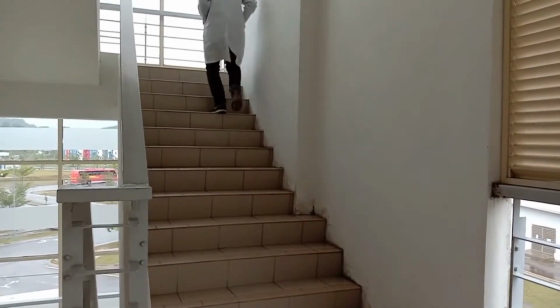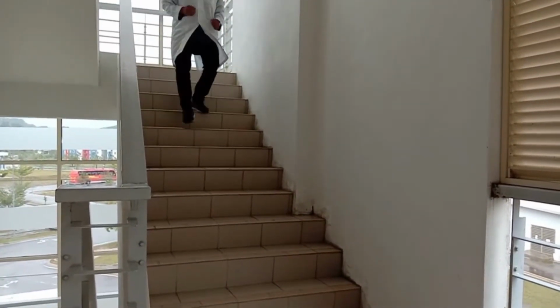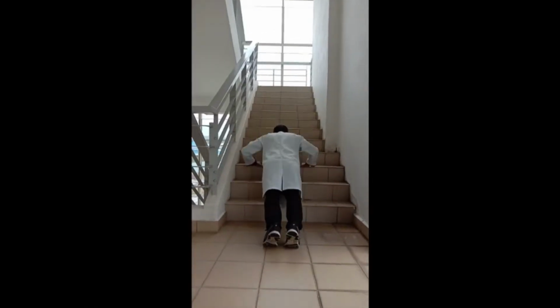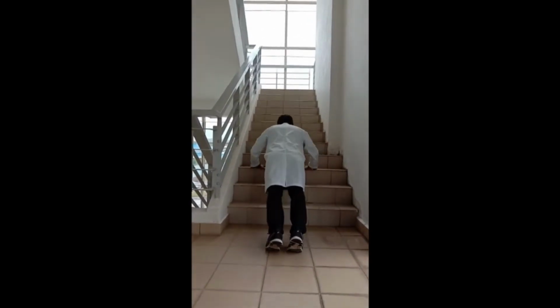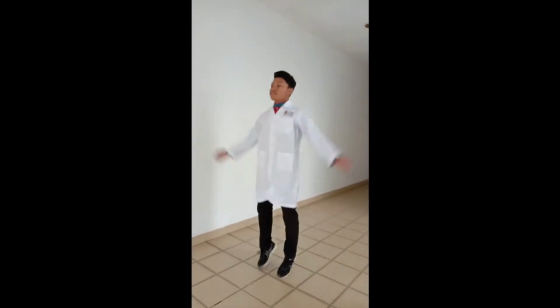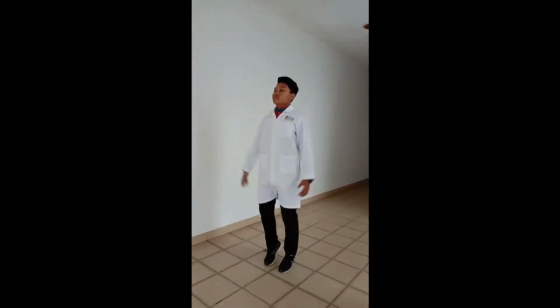Stress activity was carried out for 20 minutes. The stress activities include running, push-ups and star jumps. After 20 minutes, salivary amylase was collected from the mouth and the steps before the stress activity were followed for the after-stress activities result.